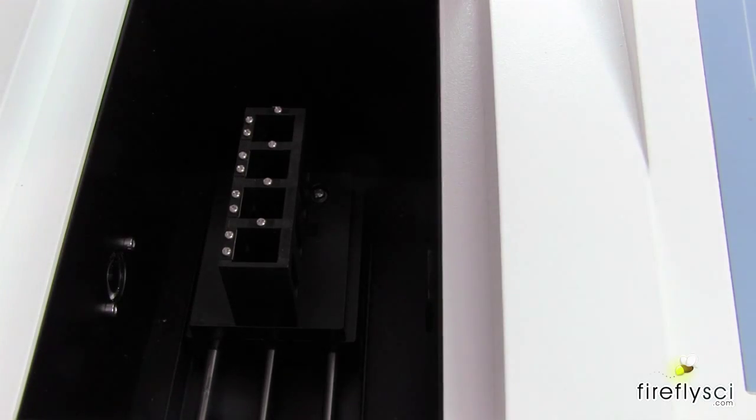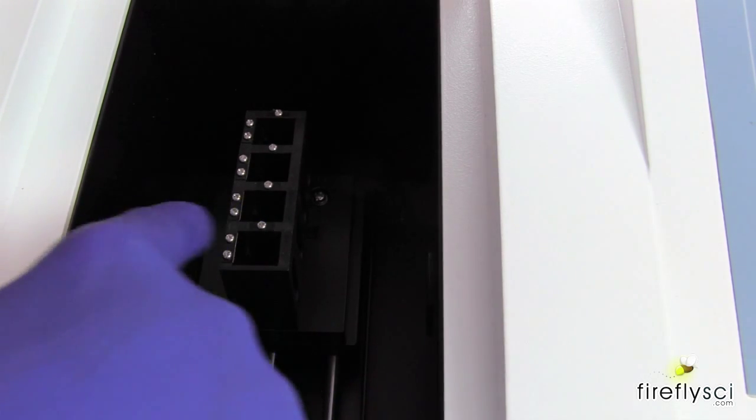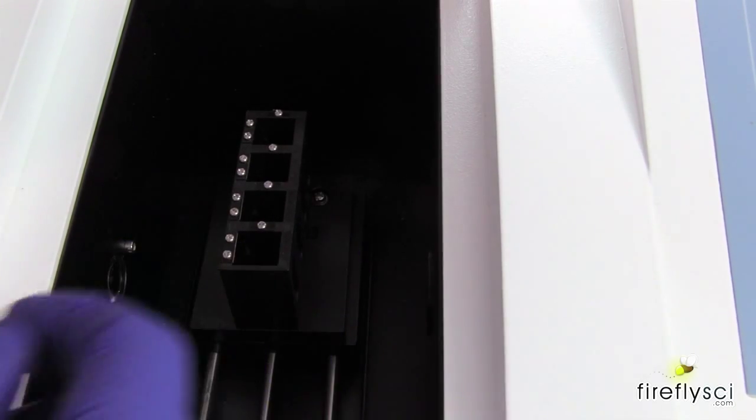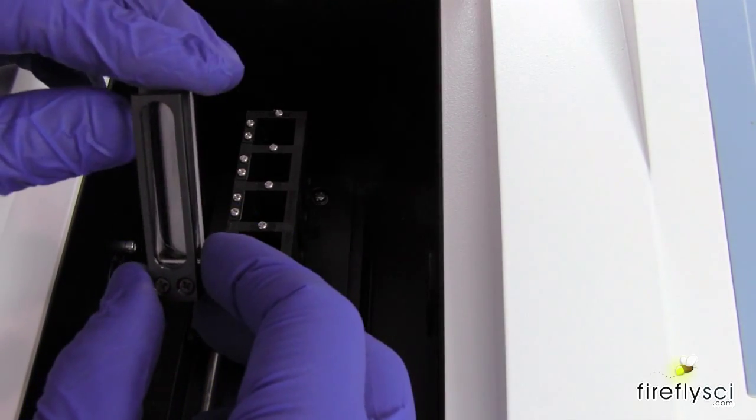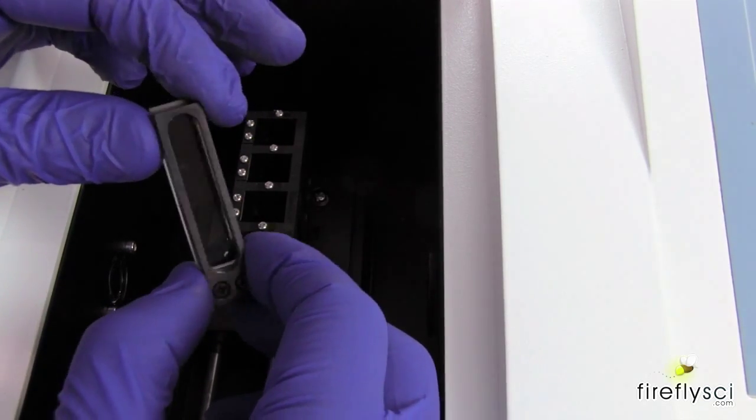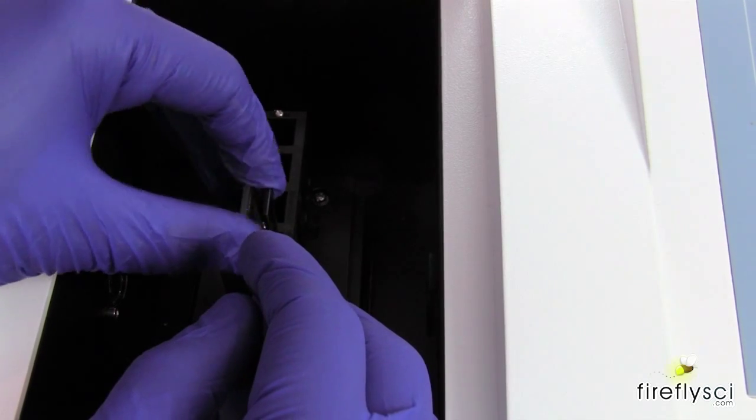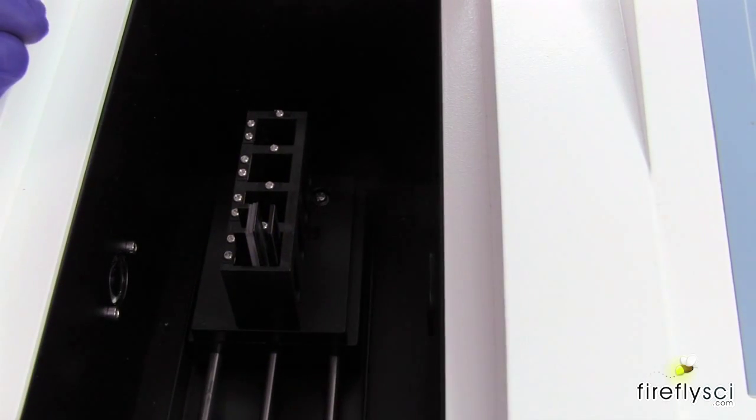So now we're going to show you how to load the A20ES cuvette mount into a spectrophotometer. So we have to make sure that the windows go in the direction of the optical beam. So we want to make sure that we put this in the right way or it's going to mess up the measurements. So for our machine, this is the way it goes in and just push until it's all the way down. And boom, it's all ready to go.